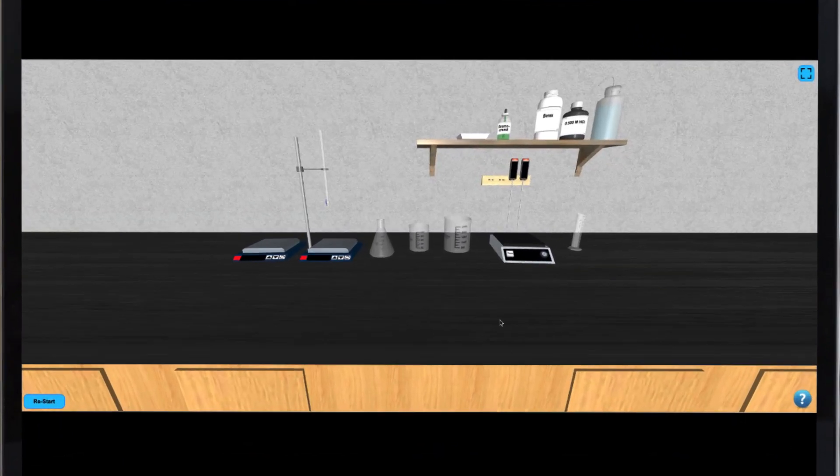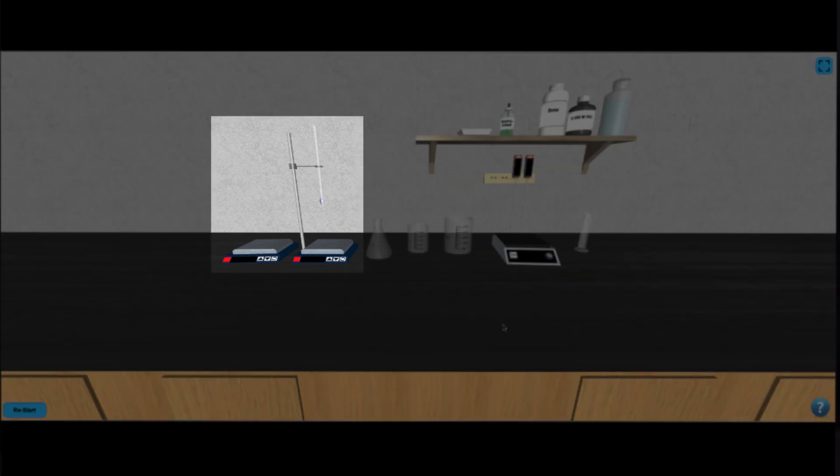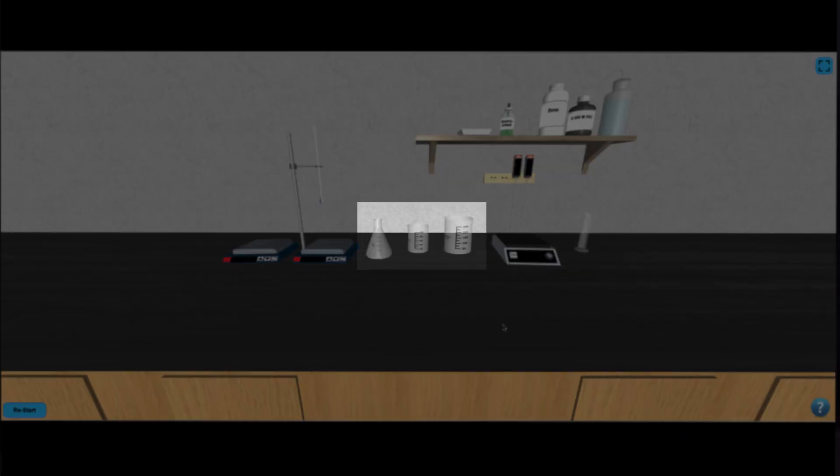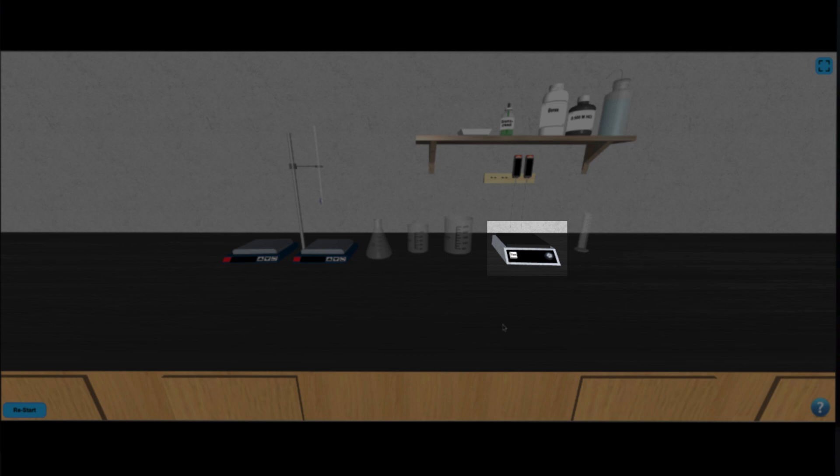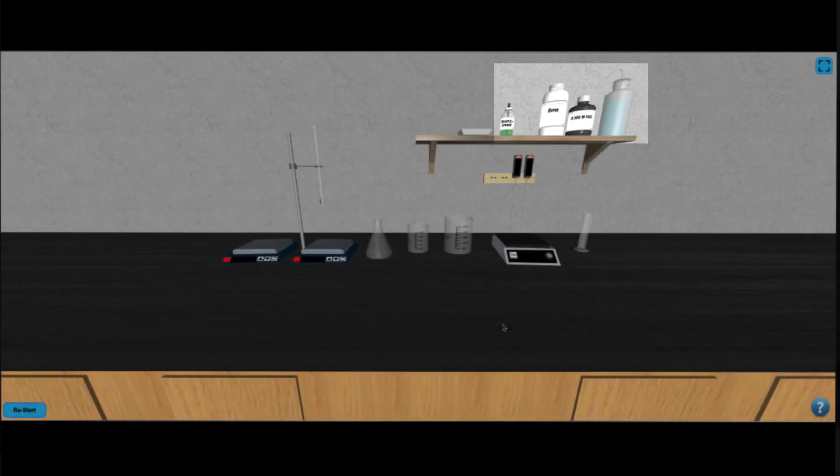In this simulation we have two hot plates and a burette, an Erlenmeyer flask and some beakers, a top loading balance, two thermometers, a graduated cylinder, weighing boats, and some samples to work with.